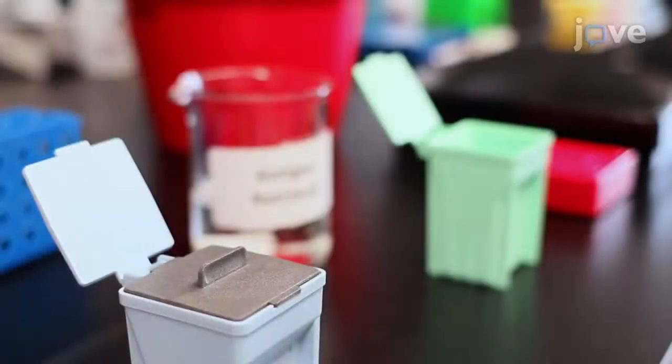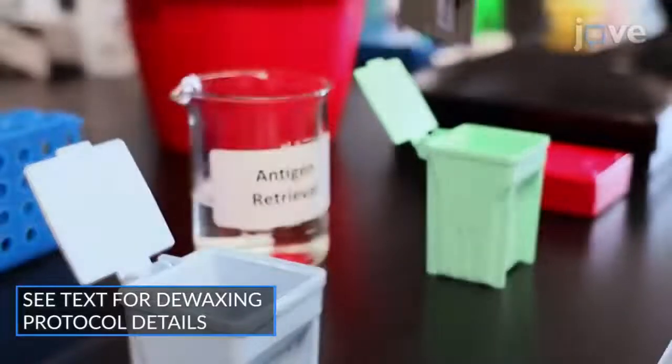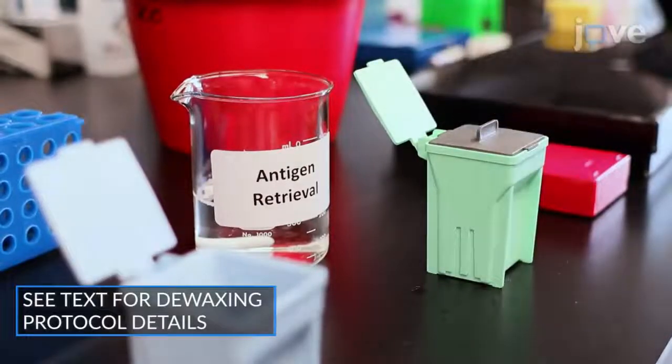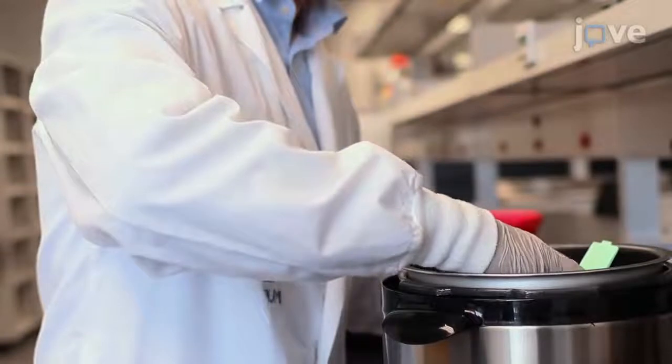For antigen retrieval of formalin-fixed, paraffin-embedded tumor tissue sections, immerse the de-waxed tissue sample in a Coplin jar of antigen retrieval solution and place the jar into an electric pressure cooker containing tap water.